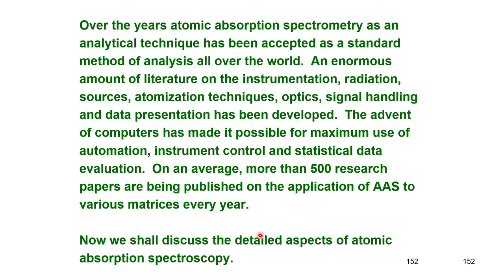On an average, more than 500 research papers are being published on the application of AAS every year. There are more than 500 applications, and what we will do from the next class onwards is discuss the detailed aspects of atomic absorption spectrometry.